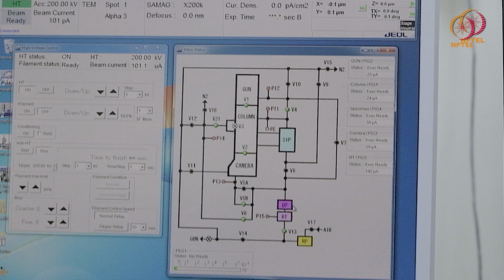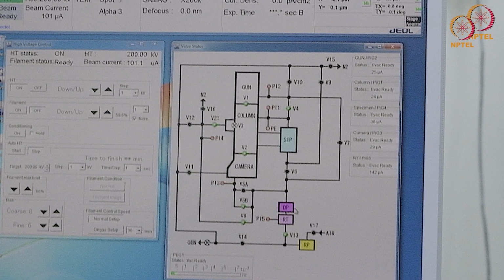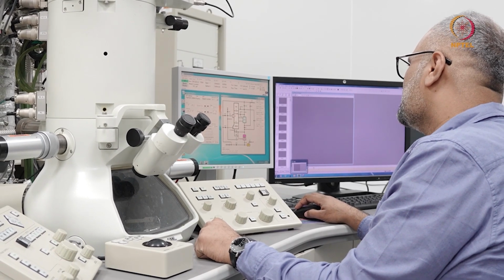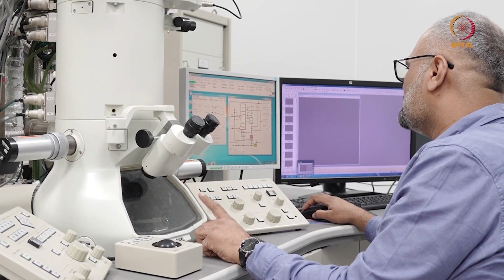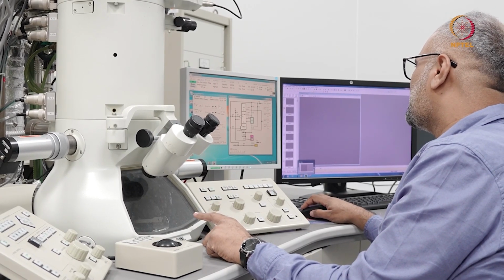You had a rotary pump, and then you have the sputter ion pump here. On this instrument, it's a 200 liter sputter ion pump. And as you can see, the sputter ion pump is connected between the column around the specimen area of the microscope.